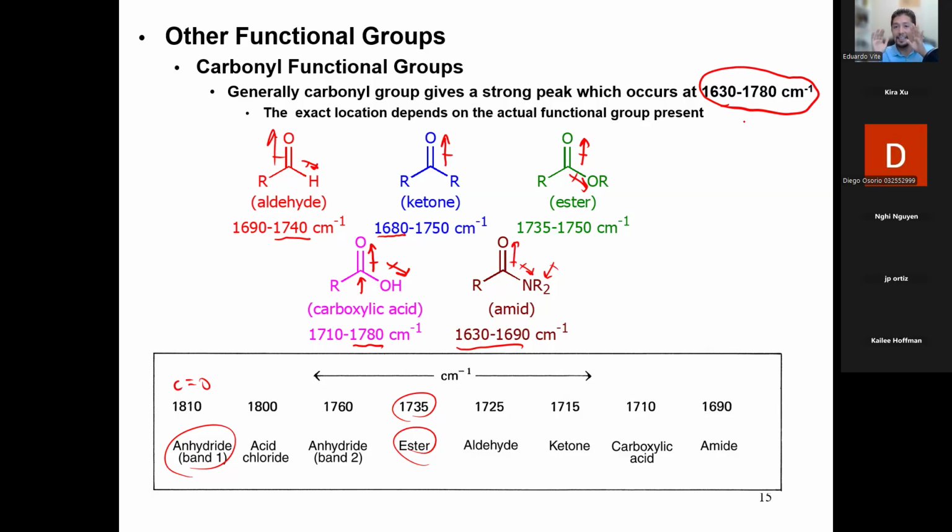If you learn nothing else from my class, please at least know where to find the carbonyls. Because if you can't find carbonyls, I mean, oh, I know how to do IR. Okay, show me. And you miss the carbonyl? That's like not knowing who Bugs Bunny is. That's like not knowing who SpongeBob is. That's like not knowing that the Pope exists. I can think of a million examples, right? You need to know the carbonyl at the very least, please.